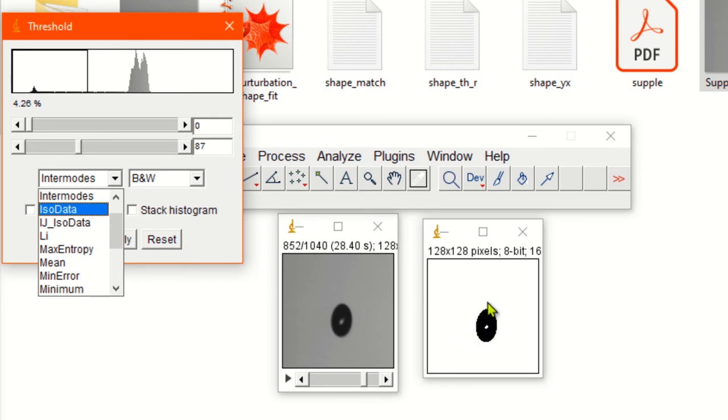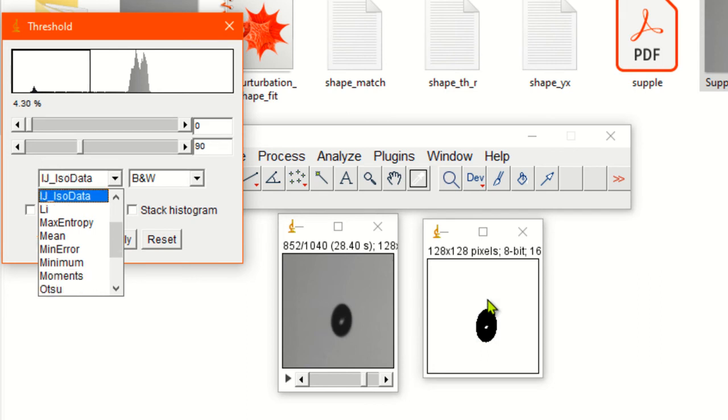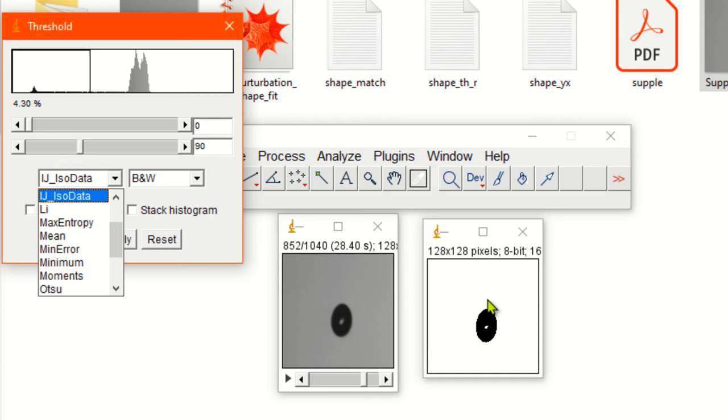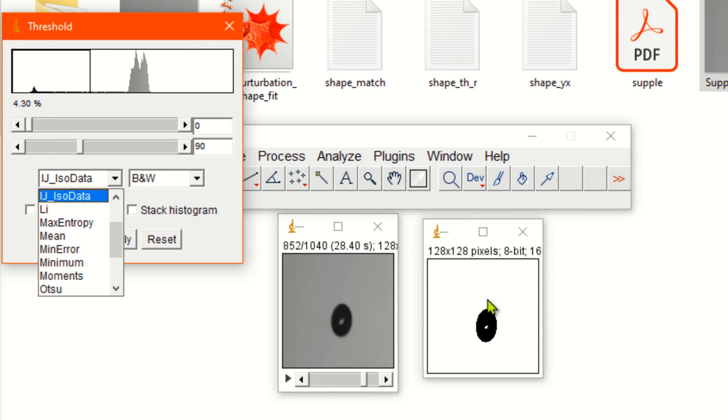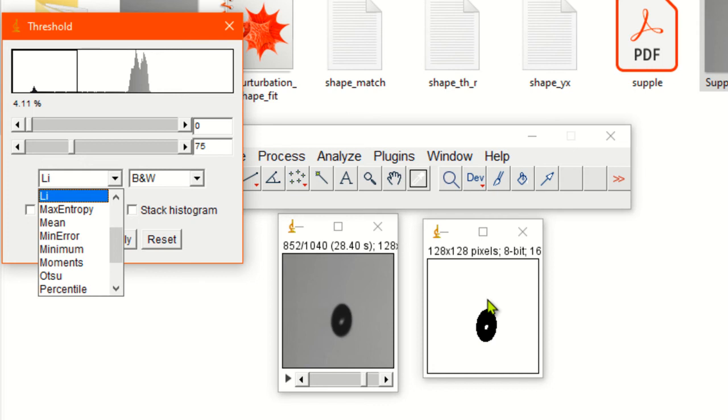You can see, for example, in intermediate modes the surface seems to be a little more uniform. Let's go to isodata. Isodata seems to be similar. Let's go to Li method.